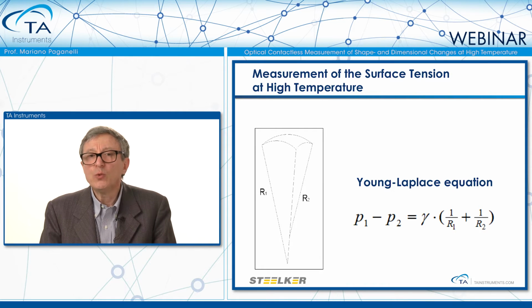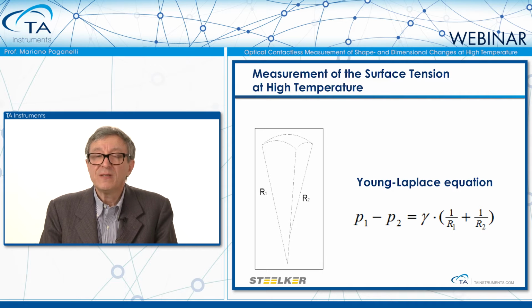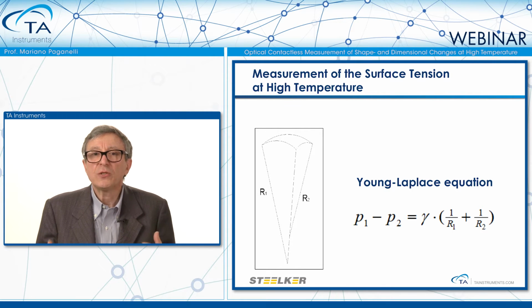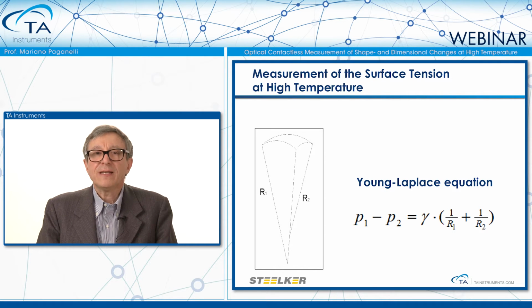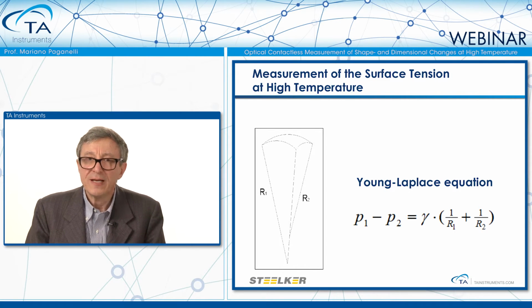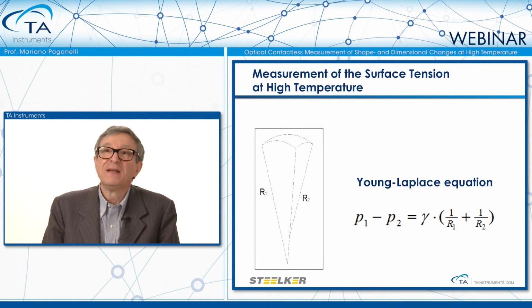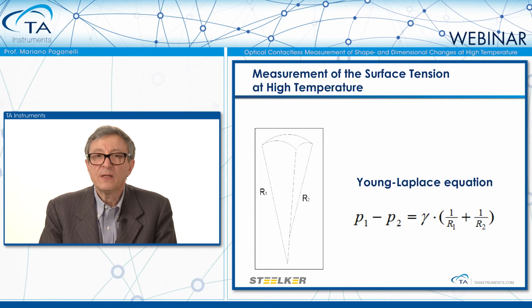Despite the beauty and the apparent easiness of the formula, this mathematical formula has no analytical solution, because developing the formula, it turns into a fourth-grade differential equation. Then the only way to solve the Young-Laplace equation, which by the way was written in 1815, is through numerical iteration.